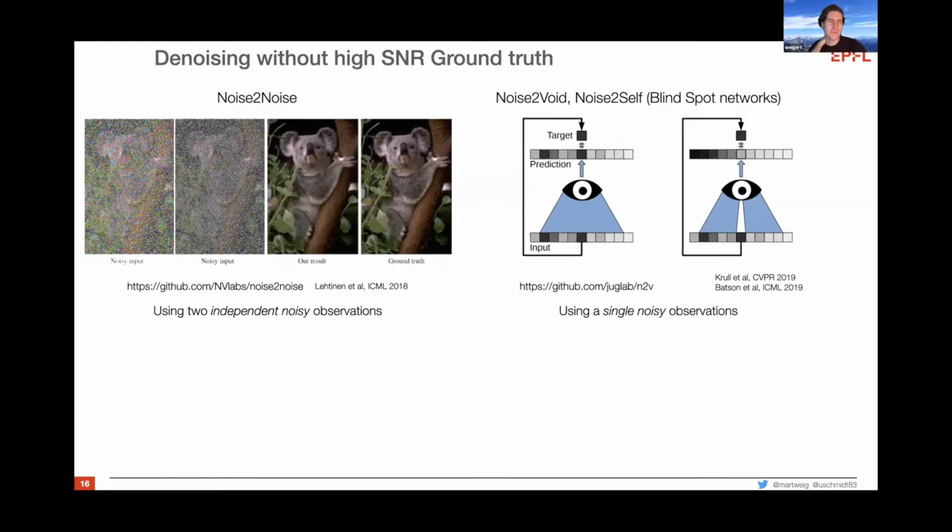So my guesstimate would be that you're never as good in modeling noise as an actual camera, because most noise models are quite simplistic. They do some shot noise, some Poisson noise, and some Gaussian background that might be pixel dependent, but a CMOS sensor of a camera is a little bit more complicated than this, and it's hard to capture that all in a perfect model.